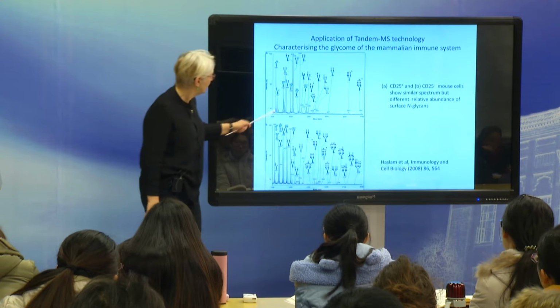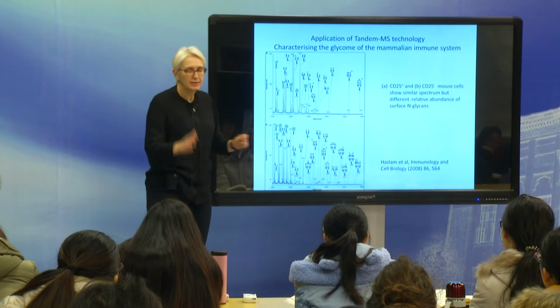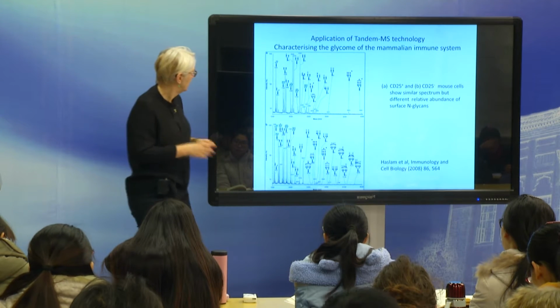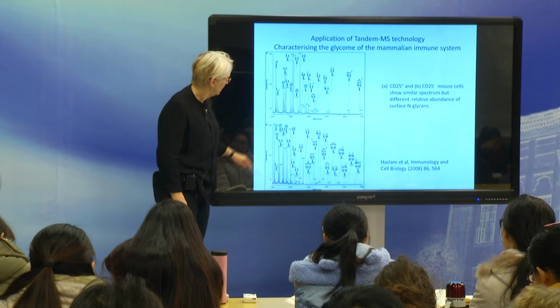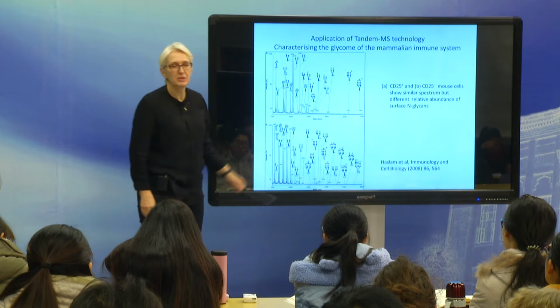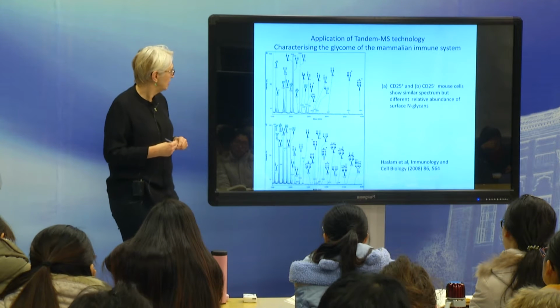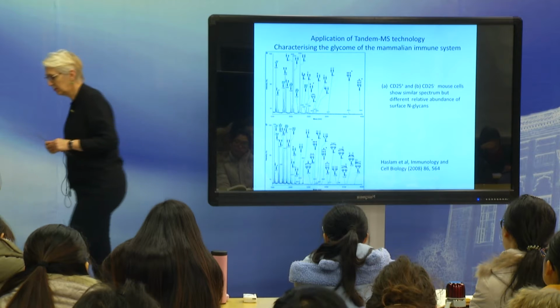I should say, you can make some assessment of the relative quantity of the peaks, not absolute quantities. So lots and lots of experiments like this are now possible, and to some extent, it's a very successful carbohydrate sequencing strategy.